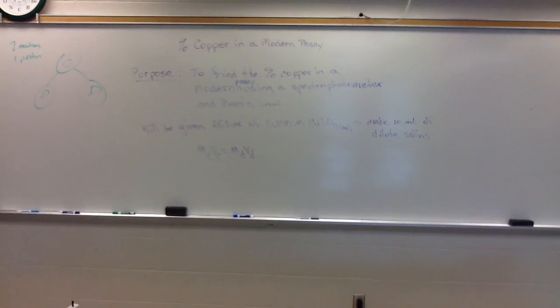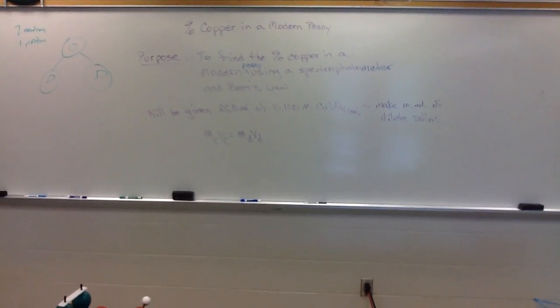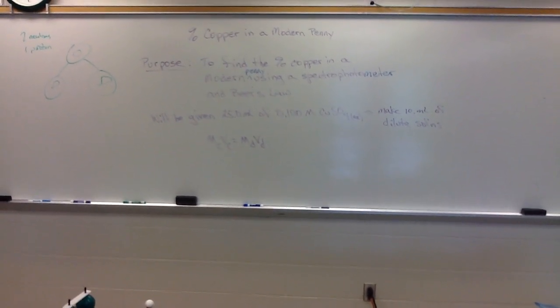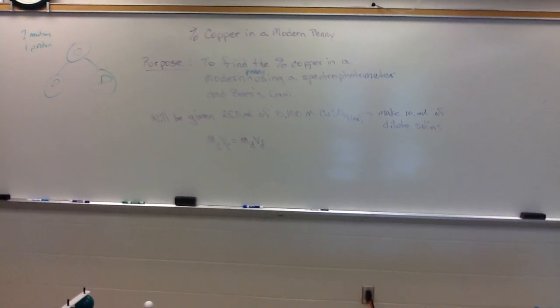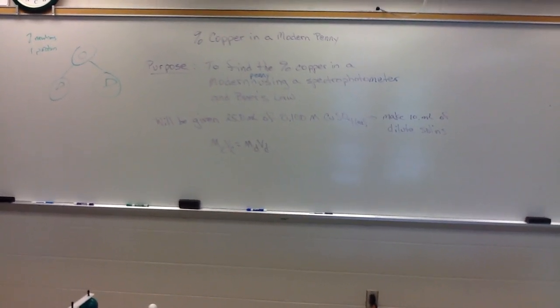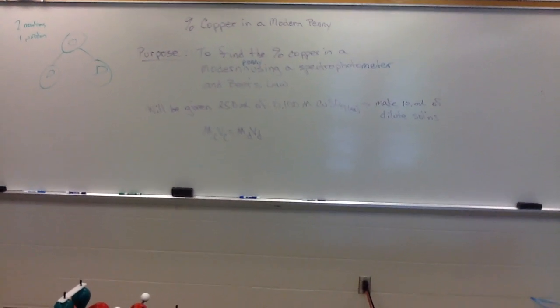Okay, so today we're in class. We are doing a lab. It's a variation of the Beer's Law lab that we did last time. Okay, and this one, the title is the percent copper in a modern penny. And so we want to find out, what is the percent copper in a modern penny?